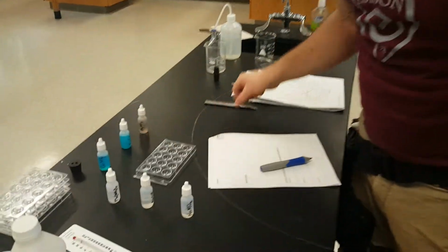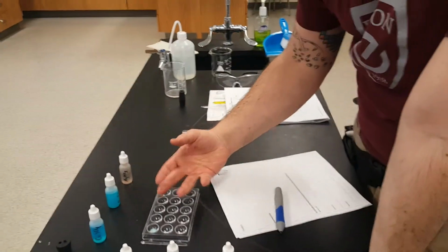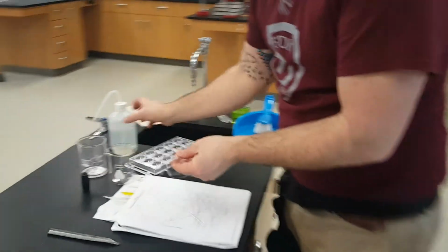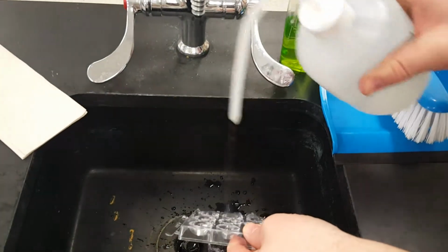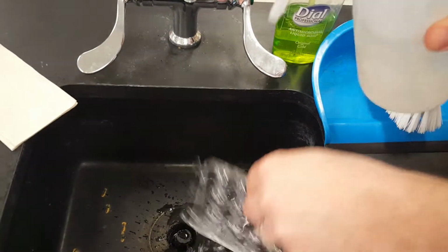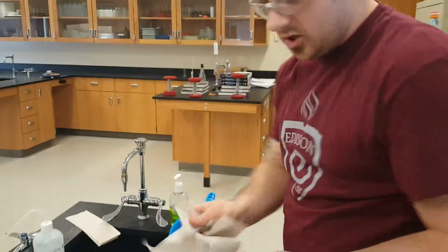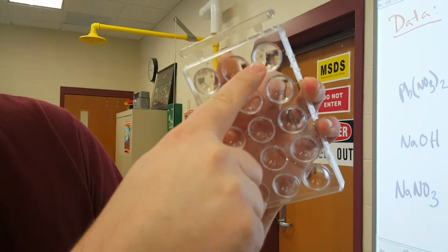So clean up. This is how you clean up over here. You're going to have a microwell plate with 1, 2, 3, 4, 5, 6, 7, 8, 9 reactions, puddles of liquids, some solids in there, some liquids. All you have to do is rinse it down the drain real careful like. Just like that. Since we're only using 5 drops of each chemical, there's really no need to collect the waste. And grab a towel or a sponge or something and wipe it out. You want the microwells to be nice and clean and clear when you're all done. We don't want any residue in there.